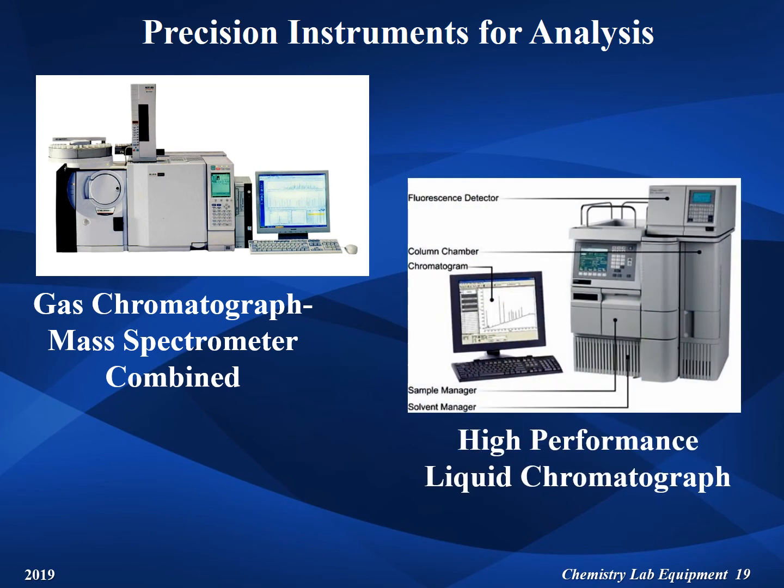Liquid chromatography uses a similar method to separate the compounds in a solution. In the high-performance liquid chromatograph shown in this photo, the process is speeded up by the application of high pressure to the solution as it passes through the column. The compounds in the solution are separated, collected, and analyzed using other techniques.